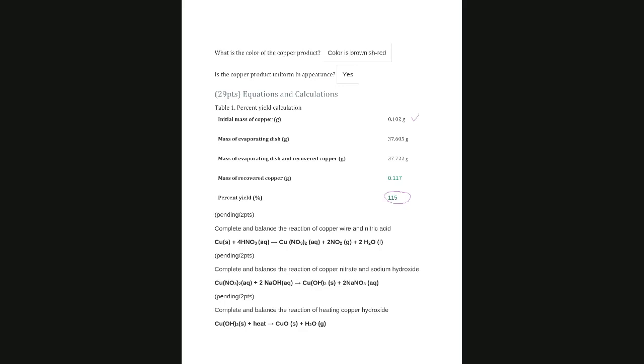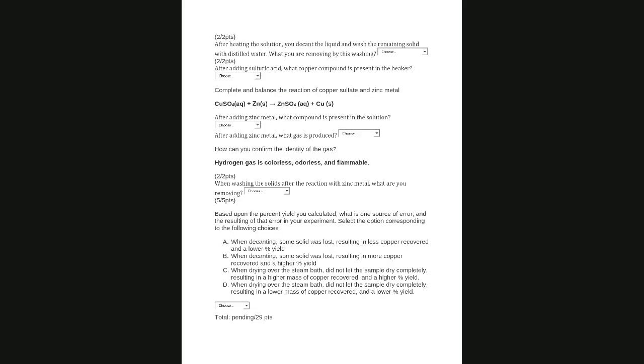And then here we are asking, after heating the solution, you decant the liquid and wash the remaining solid with distilled water.